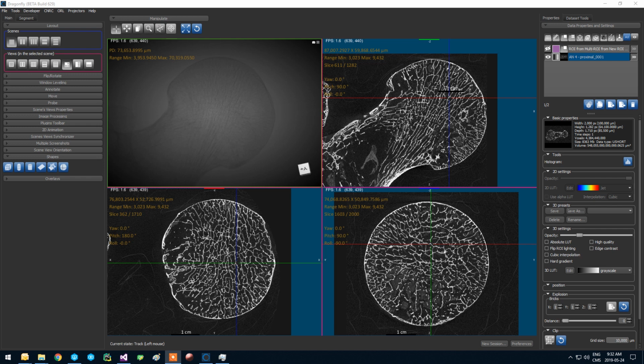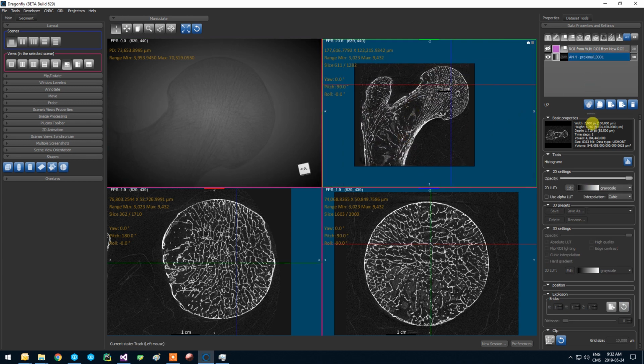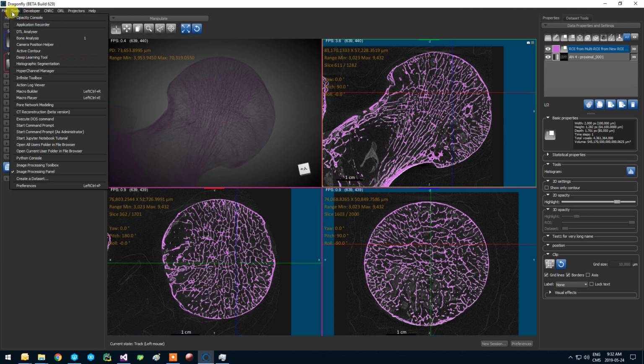This is a video tutorial on how to use the bone analysis mapping capabilities to analyze the trabecular area of a bone. So let's start with this example. I've got a femoral head. This dataset is about 8 gigabytes, and I've made a ROI based on this structure, and I want to analyze this section of the femoral head using the bone analysis.